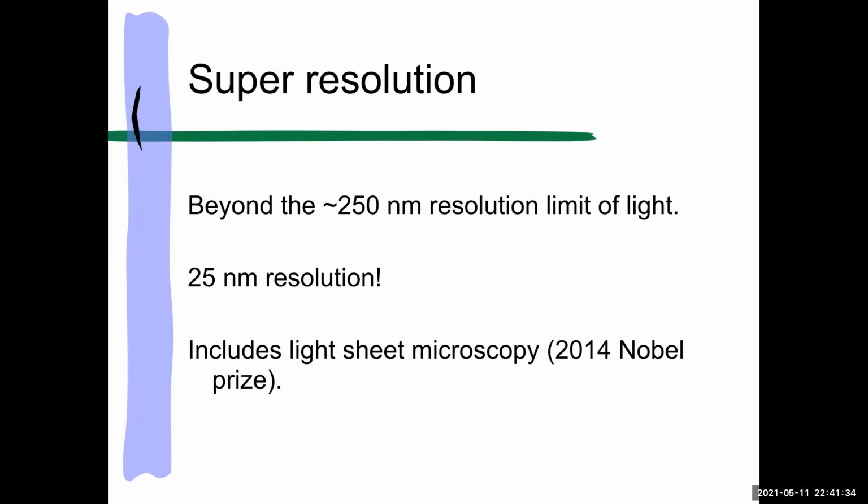There's also super resolution techniques that come from how you prepare the specimen and getting parts of it to shine at different times. So there's a lot of different super resolution techniques. There's literally hundreds just under the title of SPIM, if you look it up, which is a type of light sheet. And it's because everybody is creating their own and trying to stamp, oh, I can do it better. But they're all basically the same, except for the few that are very important and useful, that are about specimen prep. They're a little harder to use, honestly, though.